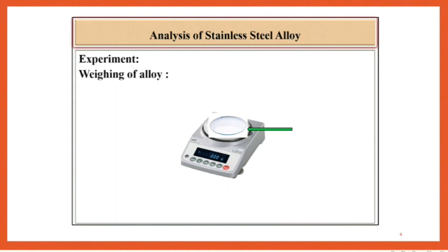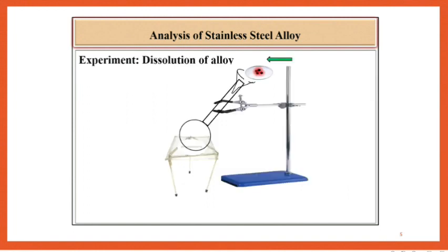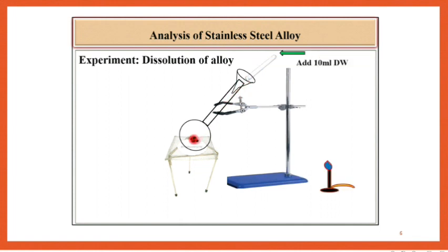Procedure: Weigh about 0.3 gram stainless steel alloy on a watch glass. Transfer this alloy into a Kjeldahl flask and add 10 ml distilled water. After this, add 5 ml concentrated HCl, keep the stem cut funnel as an air condenser.